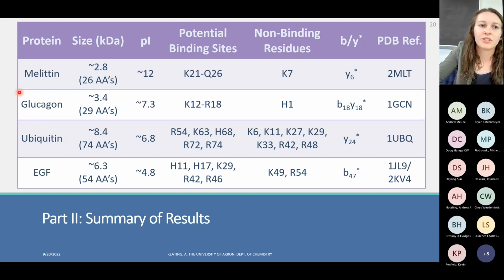So I'm interested in fractionating and getting the monodispersed forms of each of those, and then seeing how they bind to the protein, like how the trimer, tetramer, pentamer, and all of that would bind differently, because I think that would give us an idea of the residues that are further apart from one another.